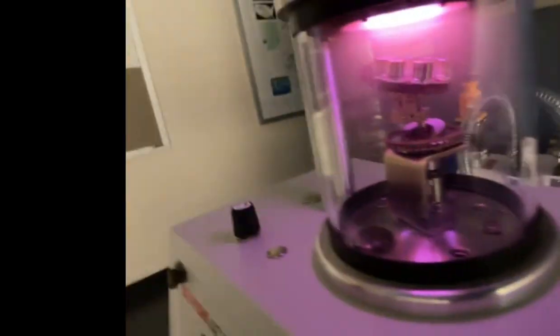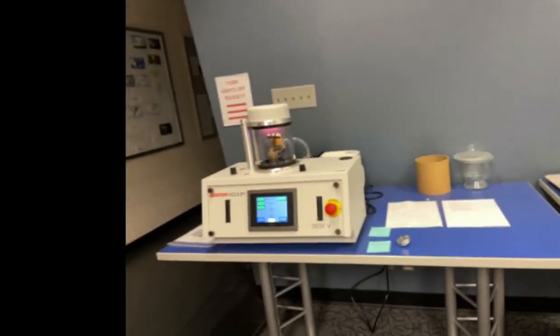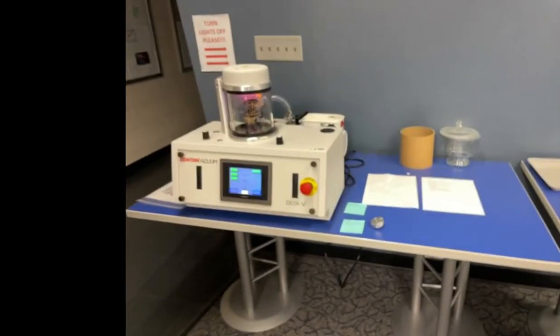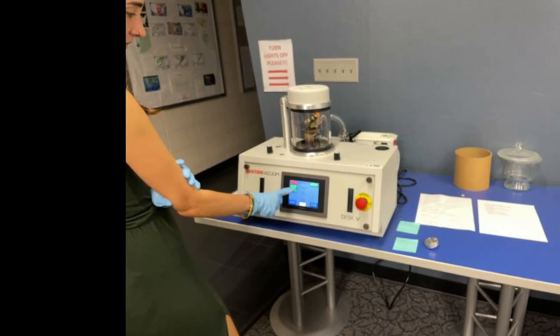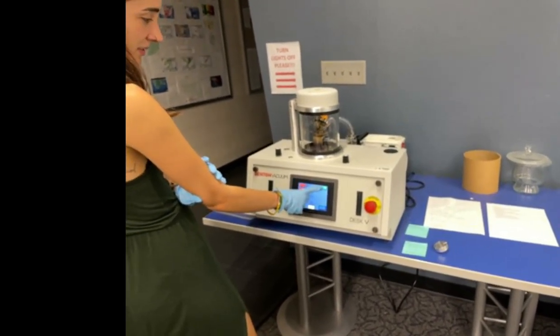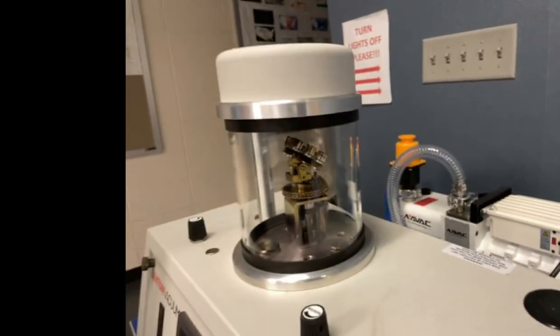Suppose the light show can probably be over. Oh, there was another carousel in here? Oh, that's the carousel, yes. We used. Probably good. So just reverse the buttons, yep. And then this one? Yep. All of them. All the green should be red. That one too. That's it. You don't have to wait or anything? Well, you have to wait till the vacuum lets up.